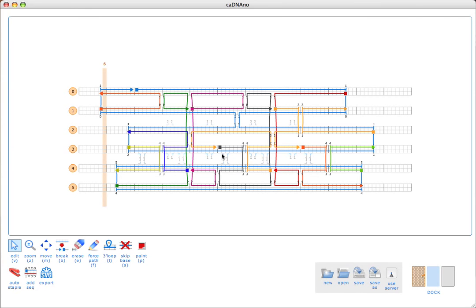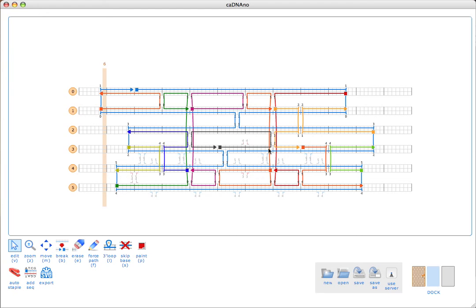We can come back in here and actually install this crossover. Then I'm going to get rid of that crossover there, because I don't want to create any topological problems by having only five bases between a scaffold and a staple crossover. I'll just edit these, and all right, that looks good.